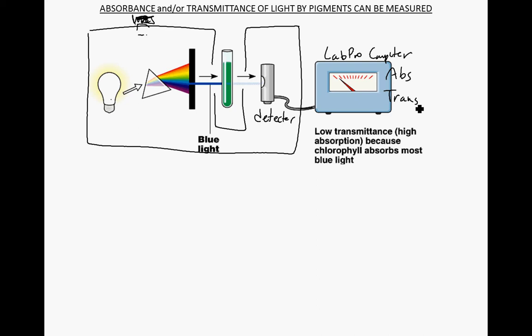And then this is where the sample would go. This is where your cuvette's going to go, right? And there'll be a little slit here where the light is going to come through.